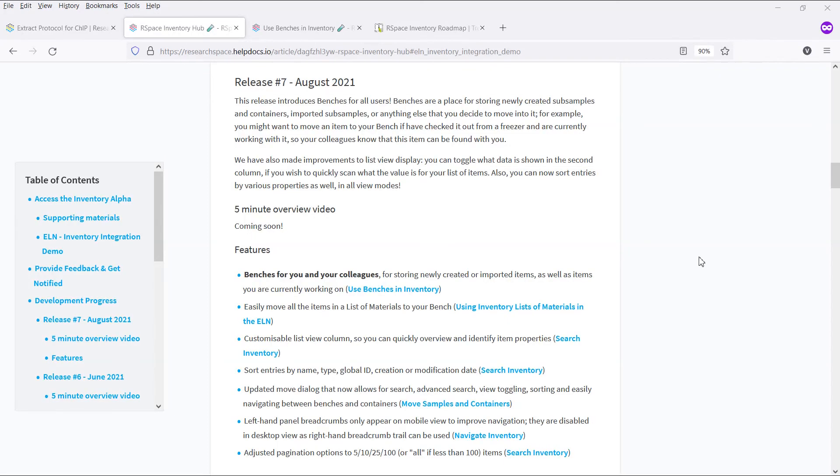That's it for this release of inventory. This is going to be the last release update before our long-awaited beta release on September the 8th, where RSpace inventory will become available to all existing and new RSpace Enterprise customers, at no extra cost.